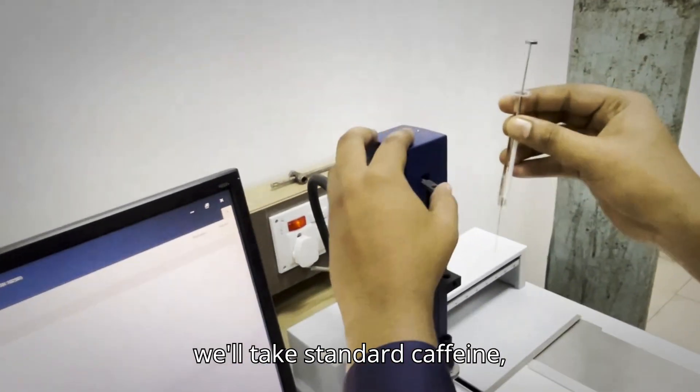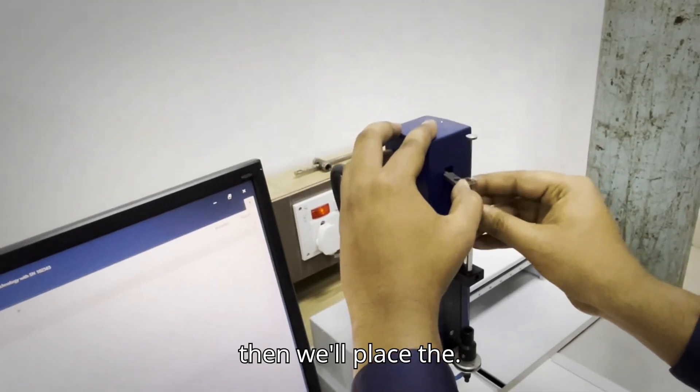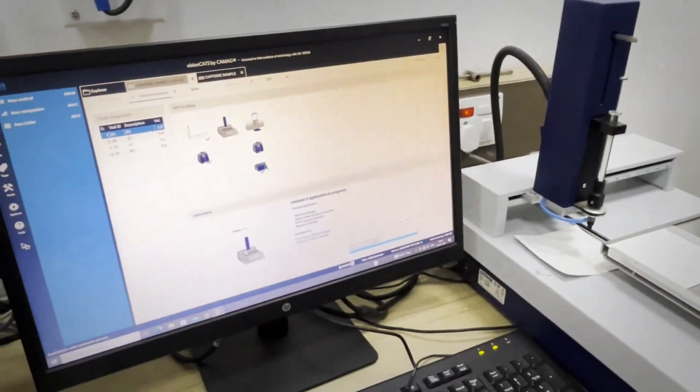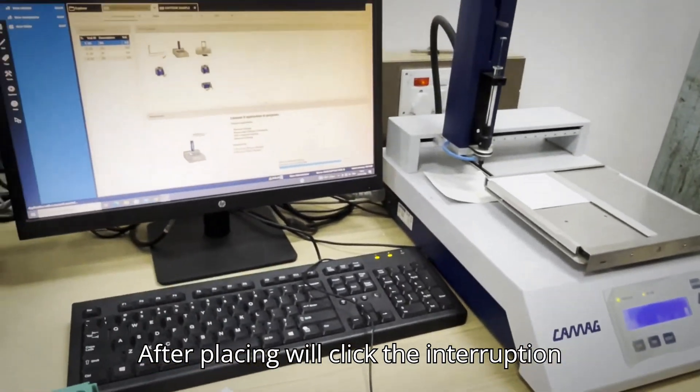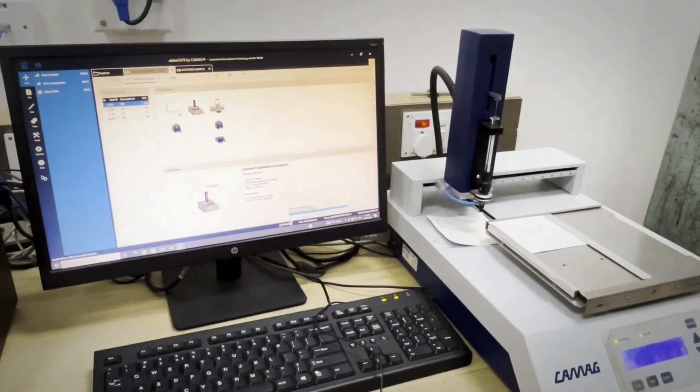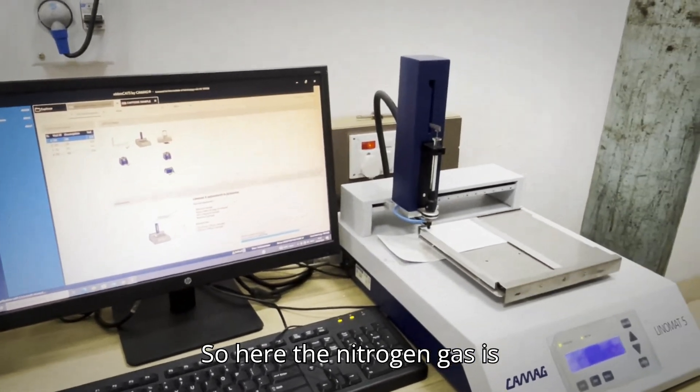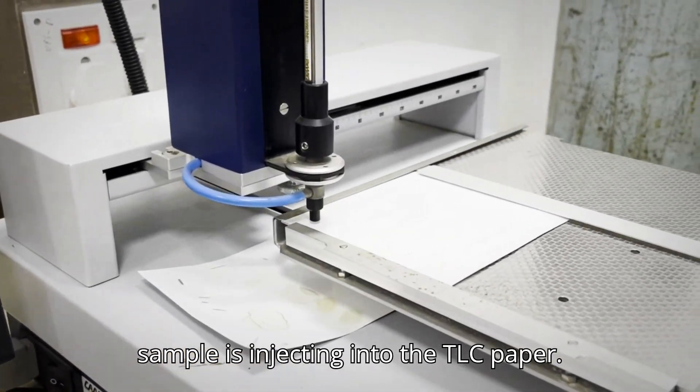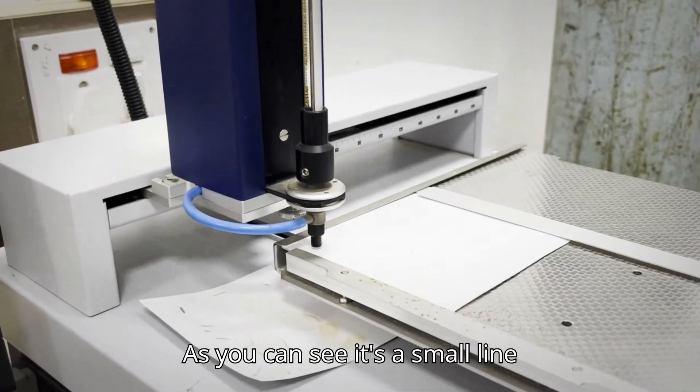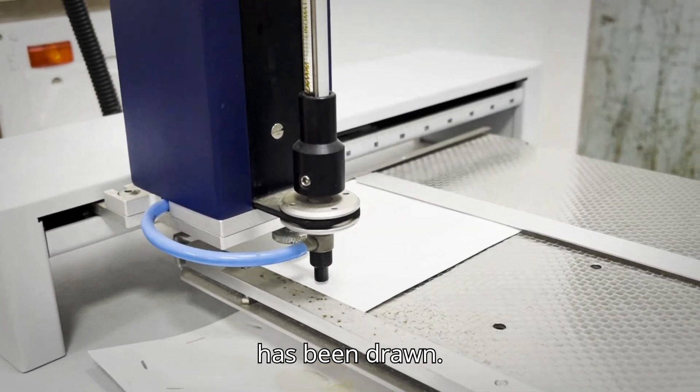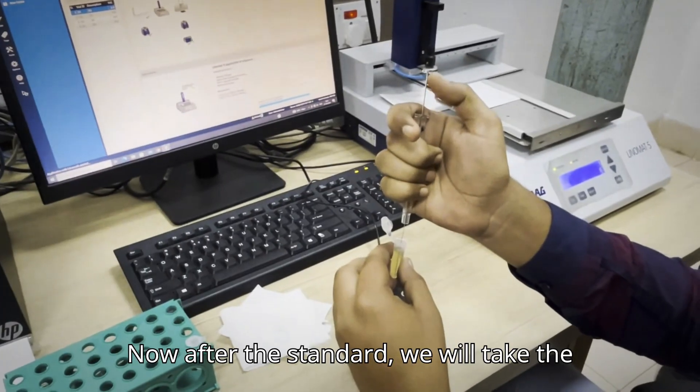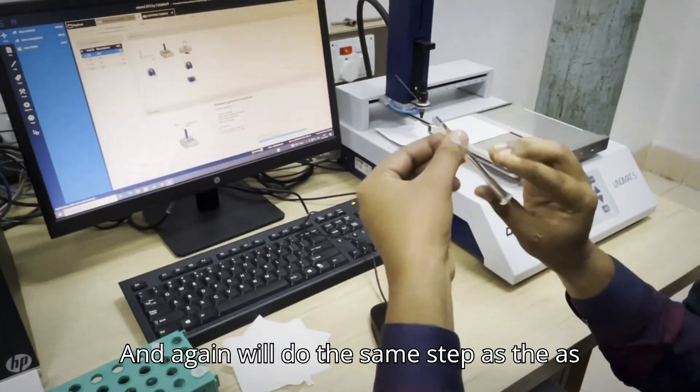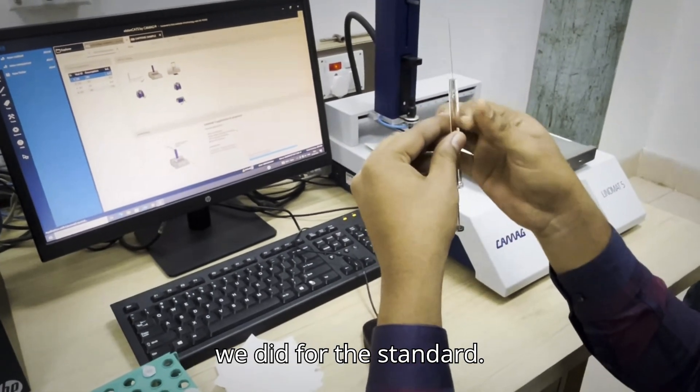Now we will take standard caffeine. Then we will place the syringe in the syringe holder. After placing we will click the enter option over here. Here the nitrogen gas is used to inject the sample. Here the sample is injecting into the TLC paper. As you can see, a small line has been drawn. Now after the standard, we will take the sample. And again, we will do the same step as we did for the standard.